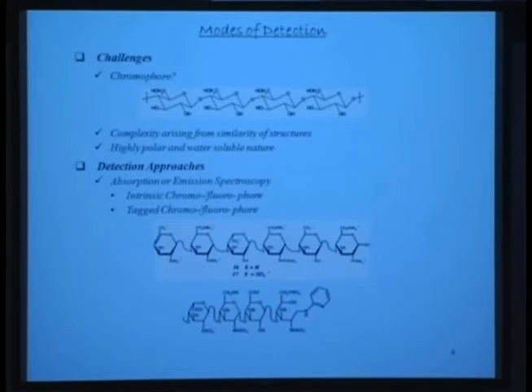but enough that we can use it for monitoring reactions and for doing isolation. This absorbs at approximately 230, 232 nanometers. Therefore, we have now generated an intrinsic chromophore which can easily be used in monitoring the digestion so that oligosaccharides can be formed. The other technique, which is most commonly used, is this kind of a labeling.